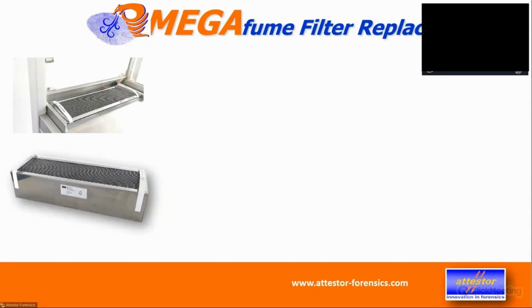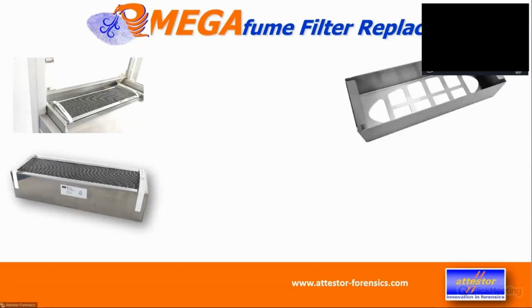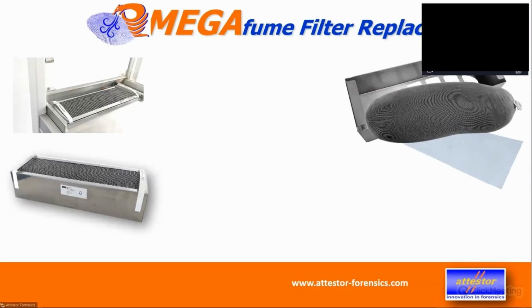Others said, oh yeah, but I think it's a bit of a waste of resources to actually always throw away this stainless steel housing around it. And for them, we came up with a second solution, which the user can choose from. So there is a kind of carrier cage made from stainless steel. You would have to buy once. And then into that carrier cage, we always have a package, a set that consists of a dust filter, which you put into the bottom of that, and then a little sachet where we have activated carbon already inside, enclosed in a sachet.